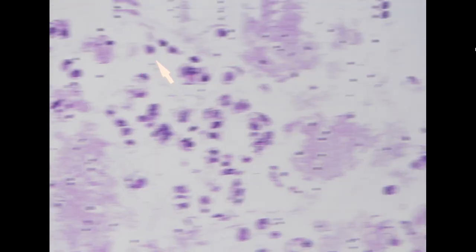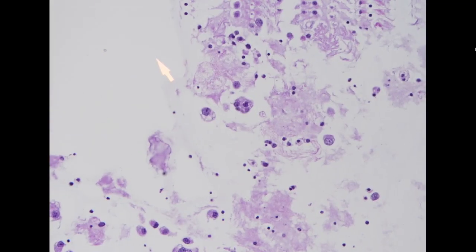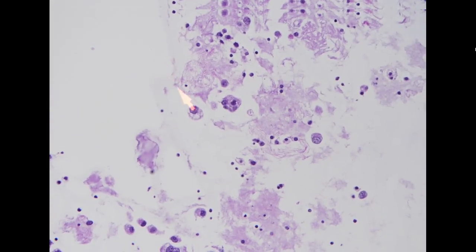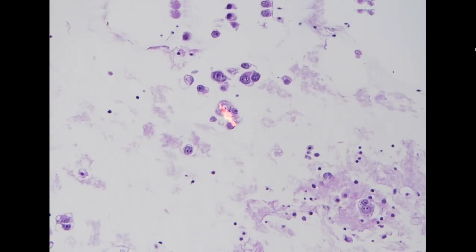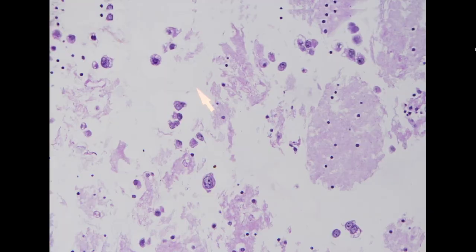For the cell block of the effusion, if they are adenocarcinoma clusters, usually around the cluster there will be an artificial cleaving space. So this is a sign that suggests these clusters of cells are more likely to be adenocarcinoma than reactive mesothelial cells.